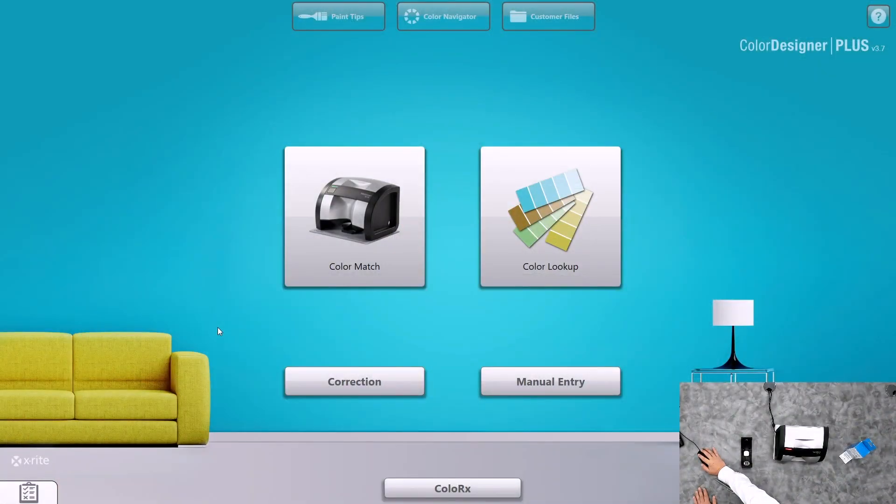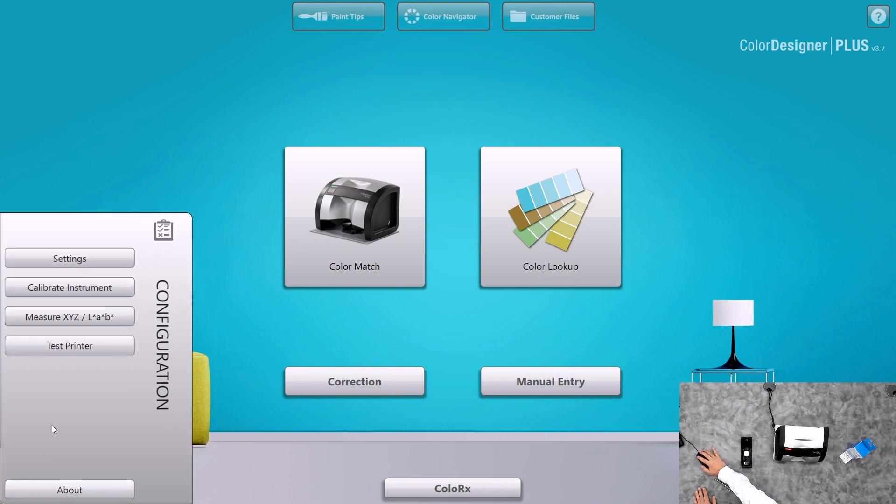We'll go into the Color Designer Plus software, and if you scroll down to the bottom left, you'll see a clipboard. It rises up, and we click on Calibrate Instrument.